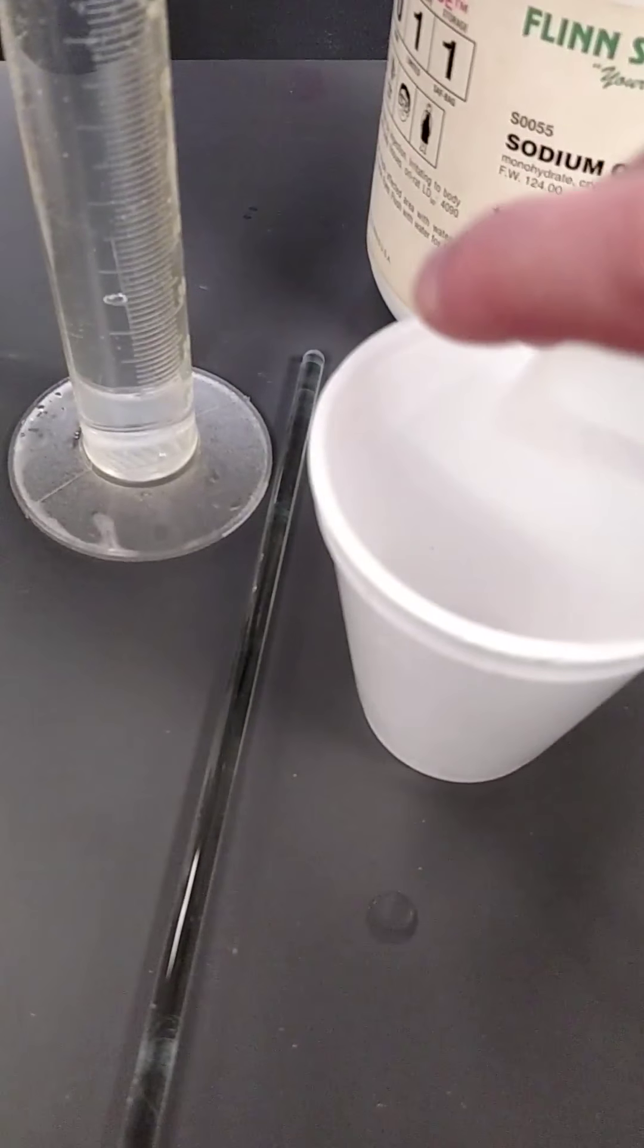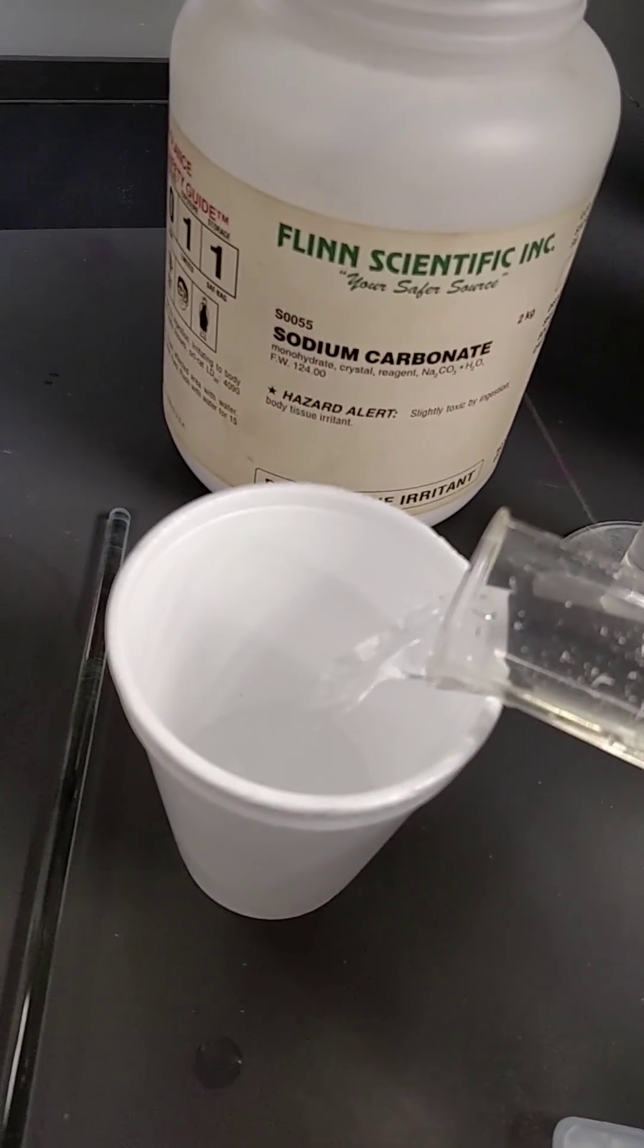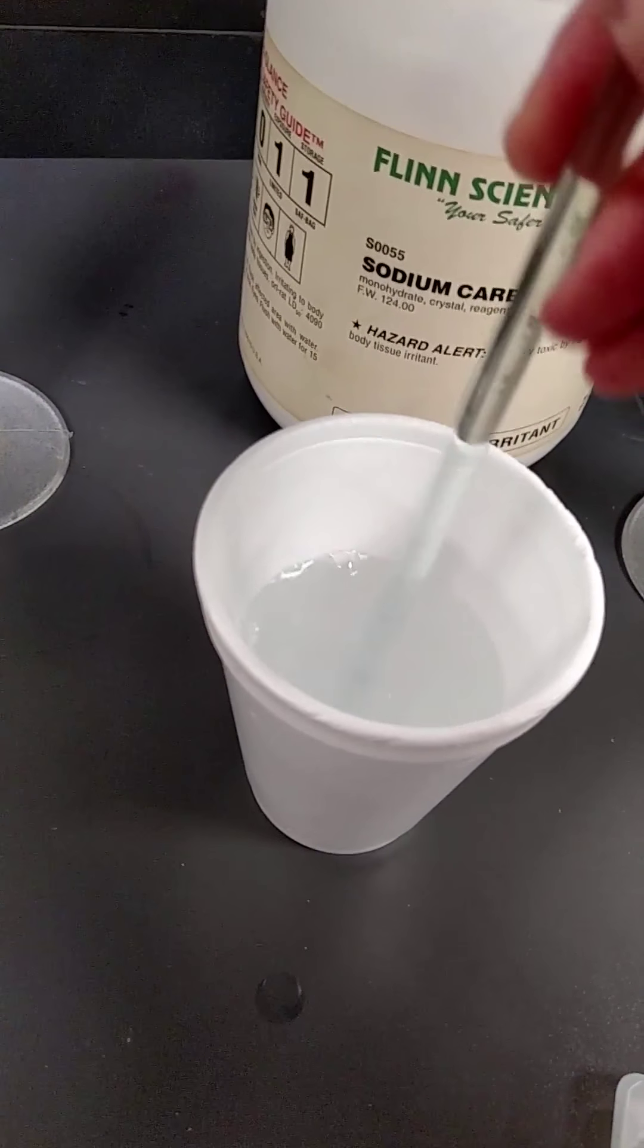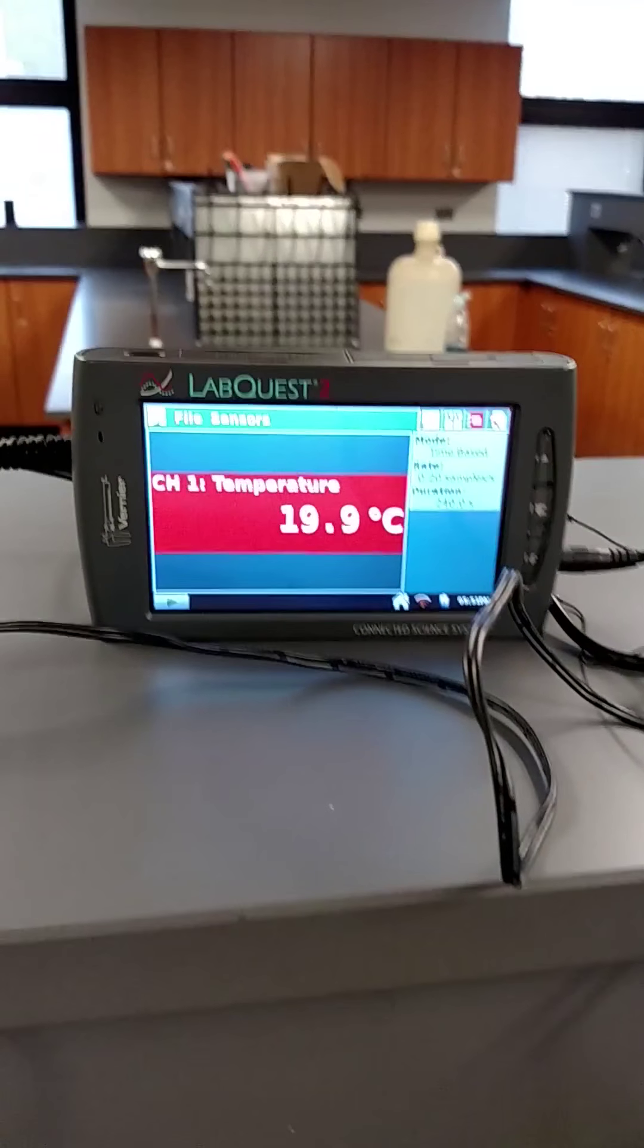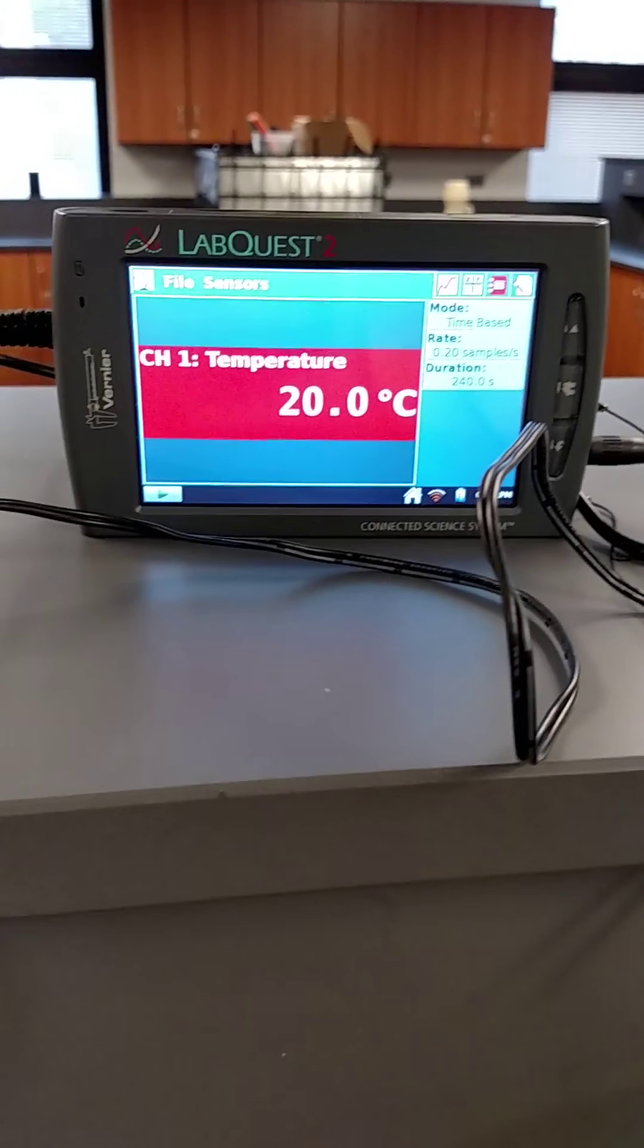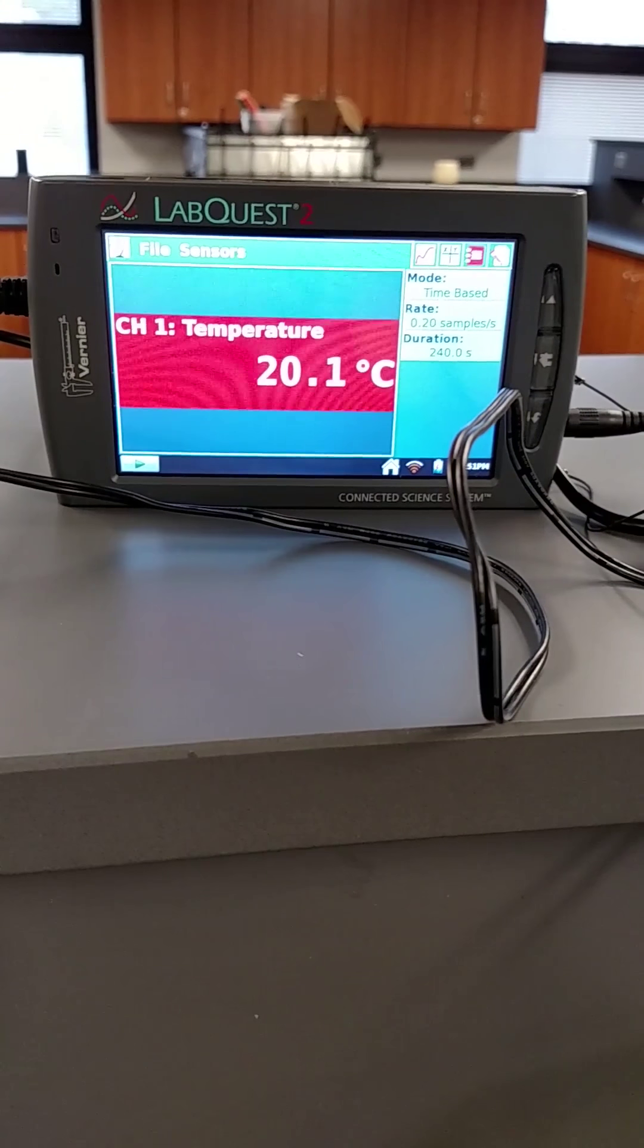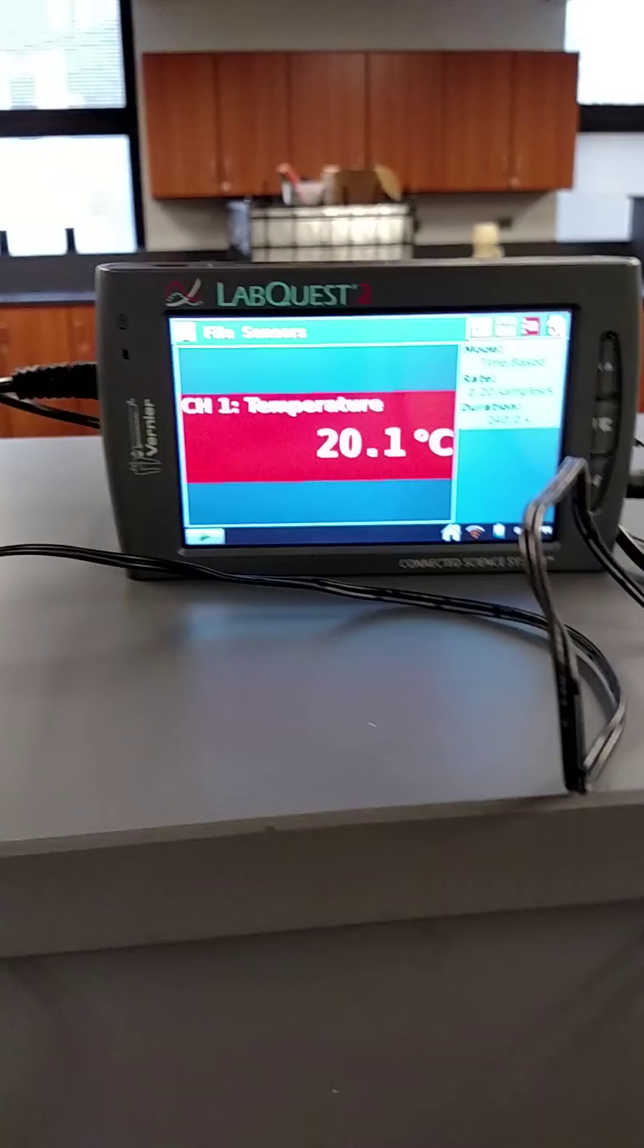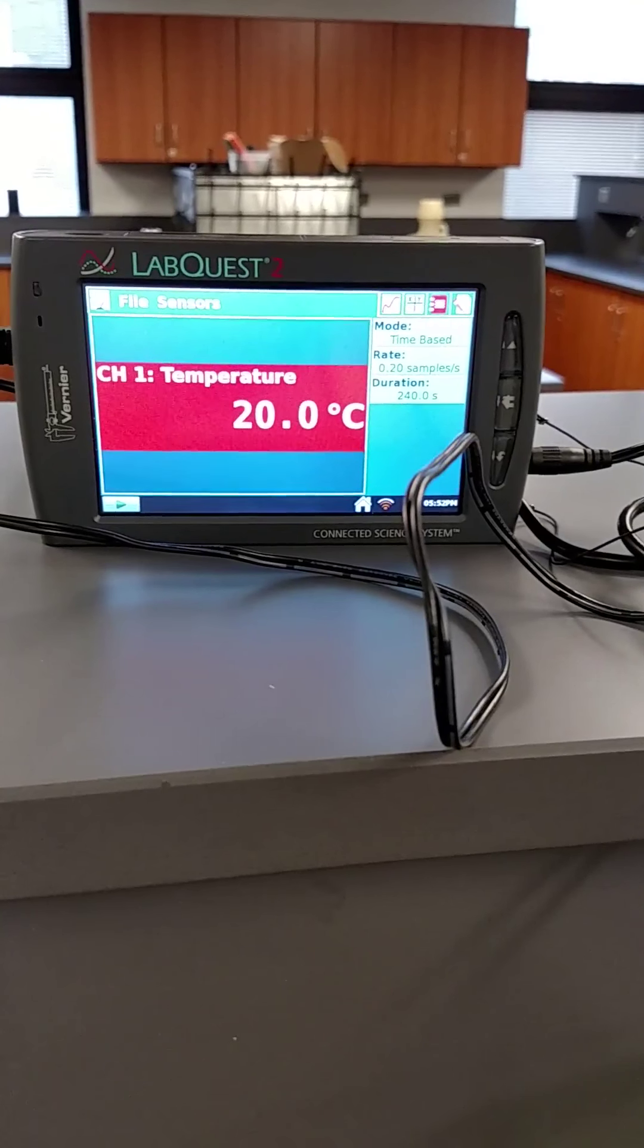Two more. Sodium carbonate. Stir. Initial temperature, 19.6. So I'm just adding these in. That's what's been happening. I believe 20.1 is the highest rate.